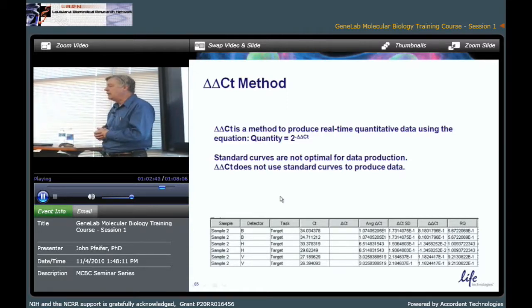It's pretty simple to use. So you're determining how many molecules of the in vitro transcribed RNA you have. Then you add a known number of molecules into a known RNA mass of control RNA. Now when you do this, just make sure that the number of molecules of the in vitro transcript far exceeds, I'd say 100-fold or better, any endogenous target that might be present in the control RNA. And that's it, you've got it.